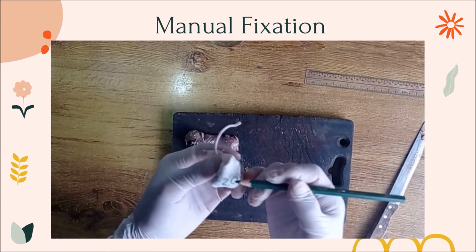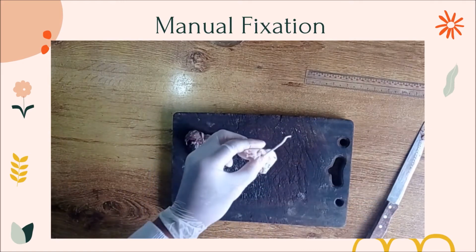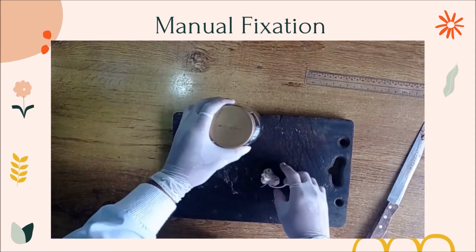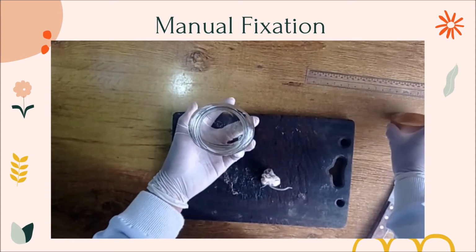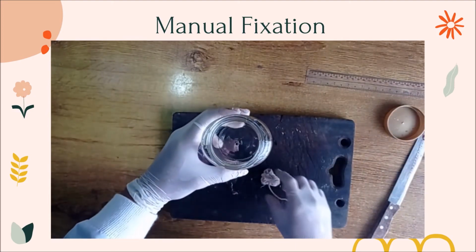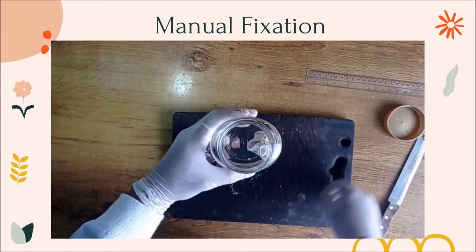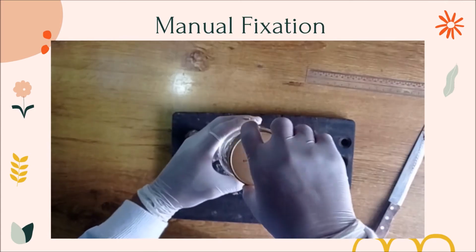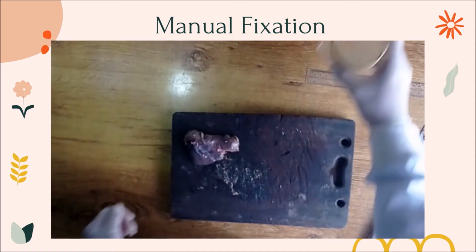So in this, I have labeled it as SP-20-142. And lastly, we will now place the specimen in the glass container with our fixative agent. Observe that it should be a 1:20 tissue to fixative ratio. Cover our tissues and leave for 18 to 24 hours.